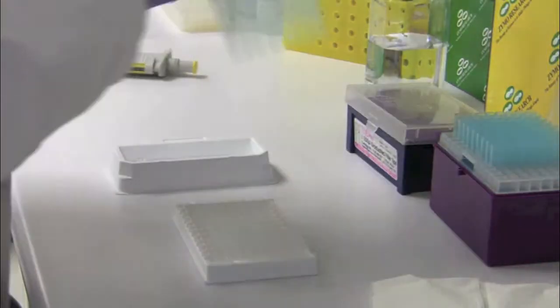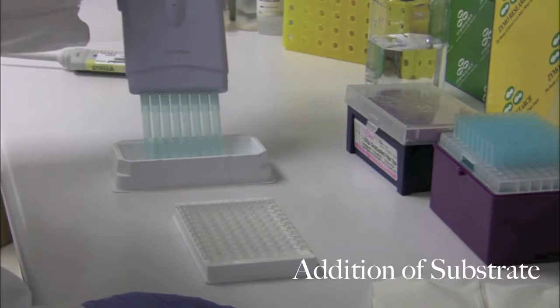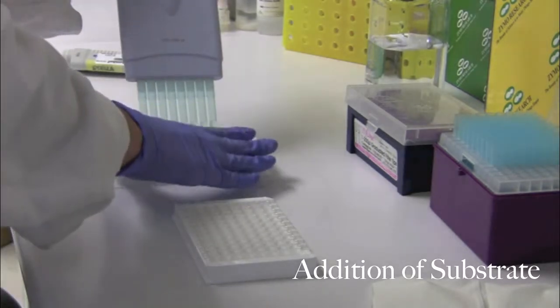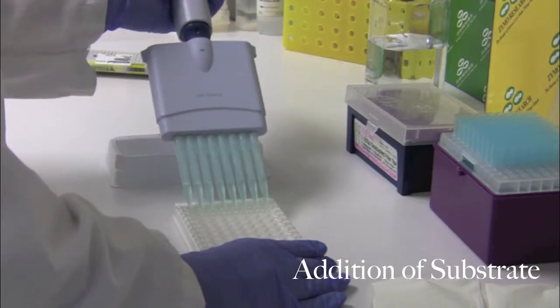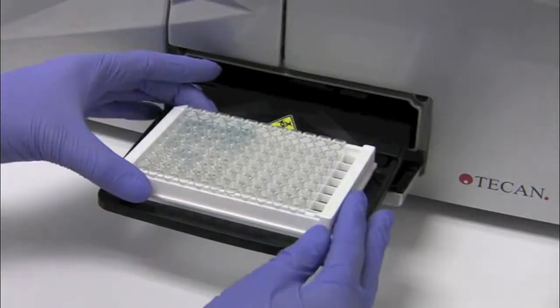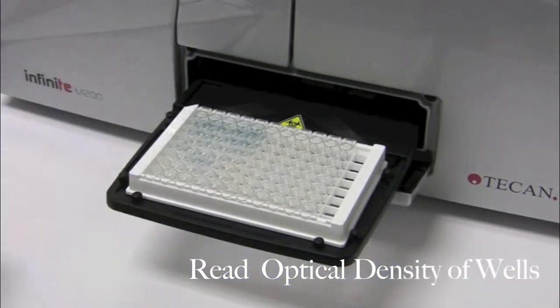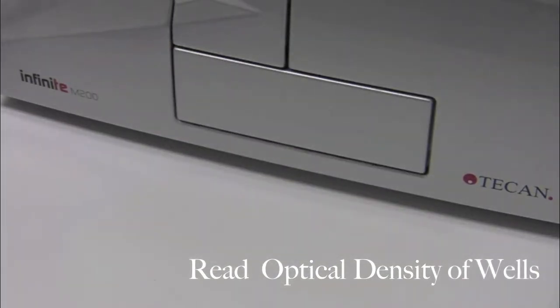Finally, the HRP developer is added. Wells that do not have any bound DNA will not change color and will remain clear. However, wells that contain 5-HMC DNA will appear a greenish-blue color. To obtain results, read the absorbance of each well at 400 to 450 nanometers. This can be done as early as 10 minutes after the addition of the HRP developer.